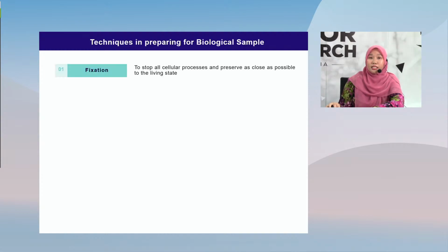Chemical fixation involves killing and preserving the organism, organ, tissue, or cells in as lifelike a condition as possible. Our ability to observe fixed biological ultrastructure using EM allows us to infer and come to understand function, to see what you want to see under TEM.